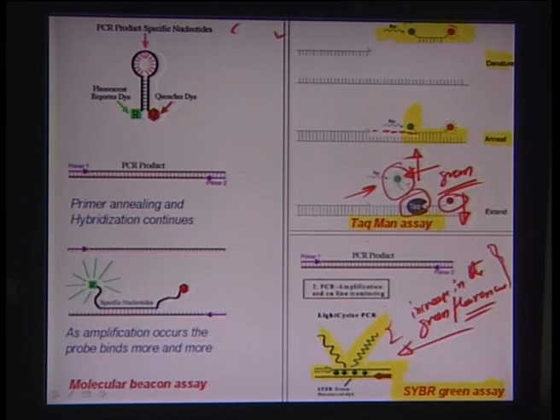So, this can give you an illustration of whether the PCR process is going on well, and that every step has TaqMan biting the DNA and creating this effect. Okay. So, essentially this also gives a real time snapshot of the PCR reaction.